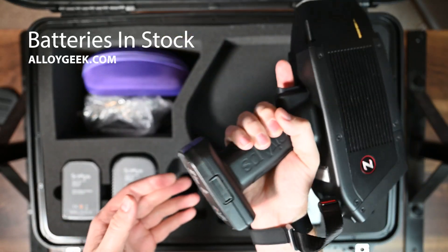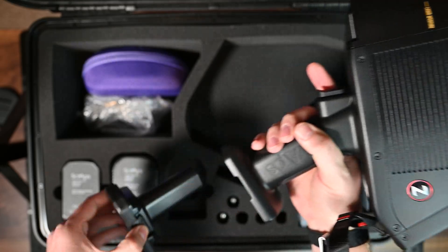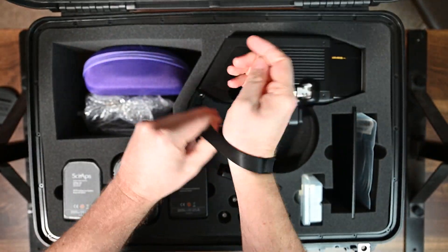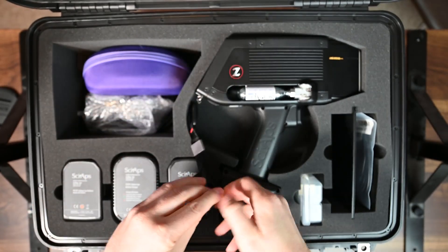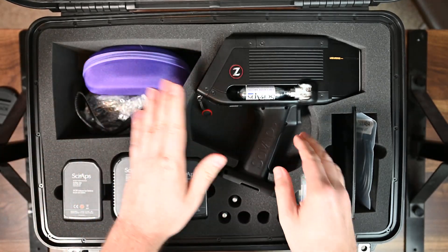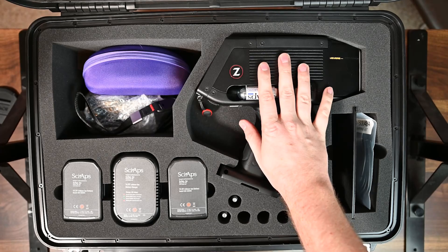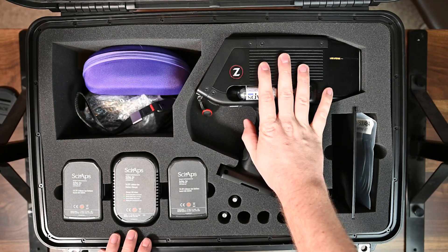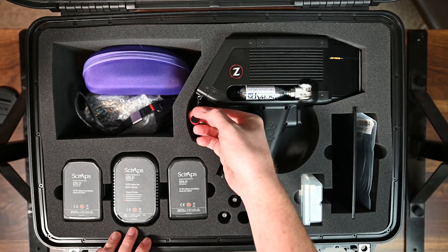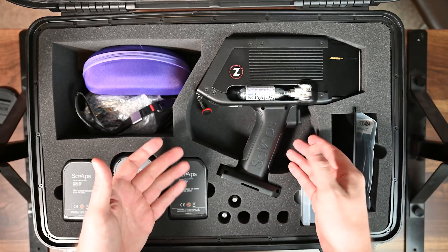The unit itself is a little heavy without the battery, but when you put the battery in it balances out pretty well, even though the battery itself is actually pretty small. A cool part about the Peak Design wrist strap is that you can detach it — all you have to do is take this part off and remove it if you don't want to use it. But I'd always recommend keeping the wrist strap on with any expensive piece of equipment like this spectrometer.